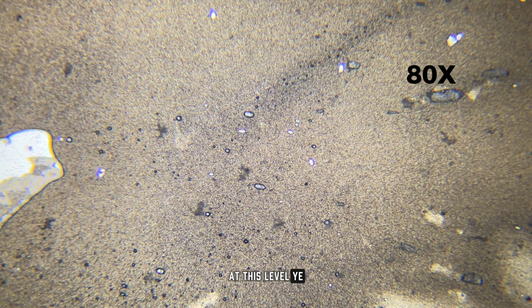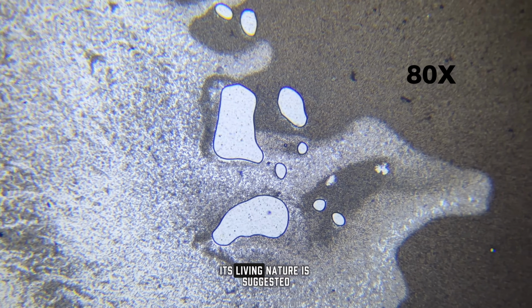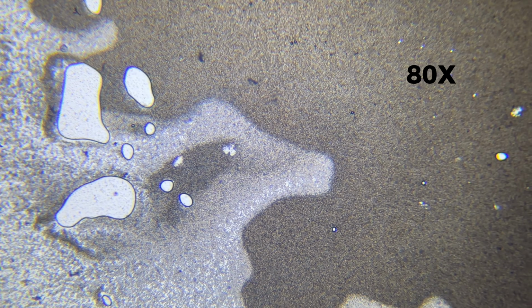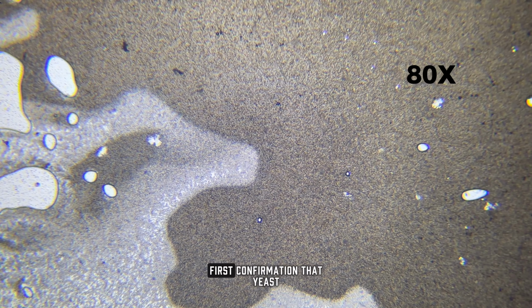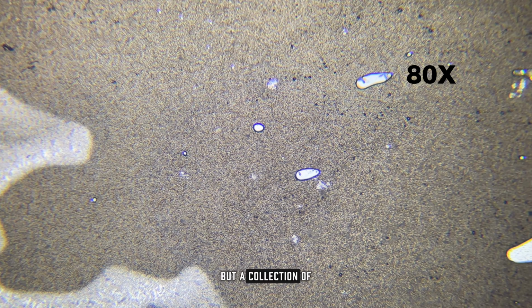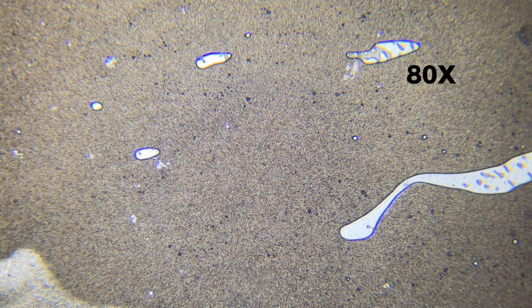At this level, yeast still feels quiet and restrained. Its living nature is suggested, but not yet fully revealed. This magnification offers a first confirmation that yeast is not dust or powder, but a collection of separate microscopic bodies occupying space.